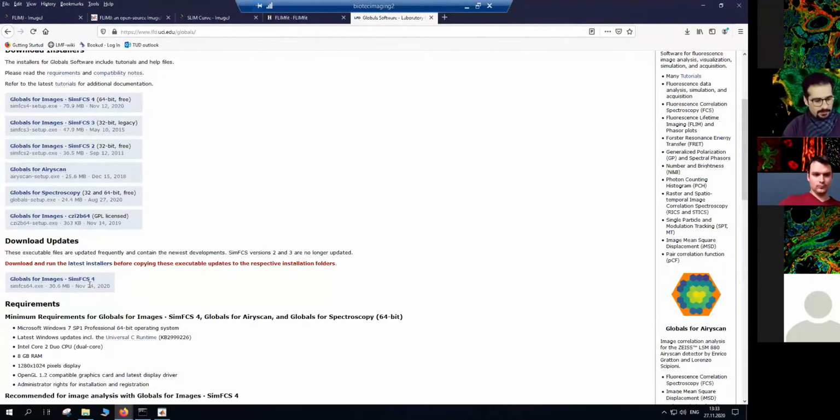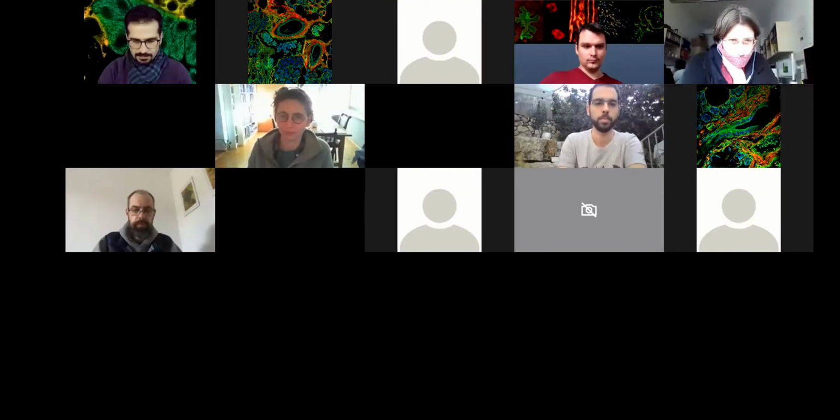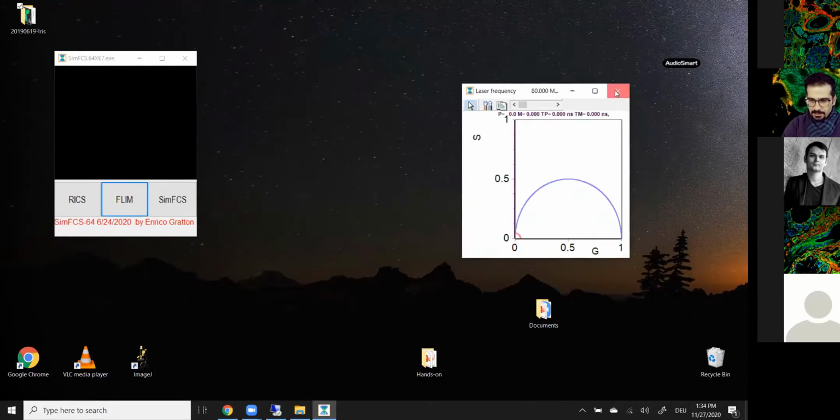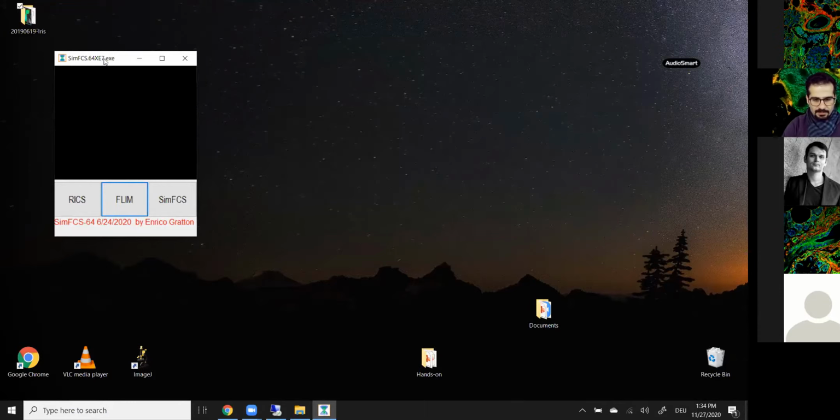I'm not talking about that today because, to be honest, I don't have experience with the software, and I would love to start to know it and how it works. So shortly going to the other screen, stopping that, and then coming here. Here is how it looks when you just double click on the software. This is what you see.